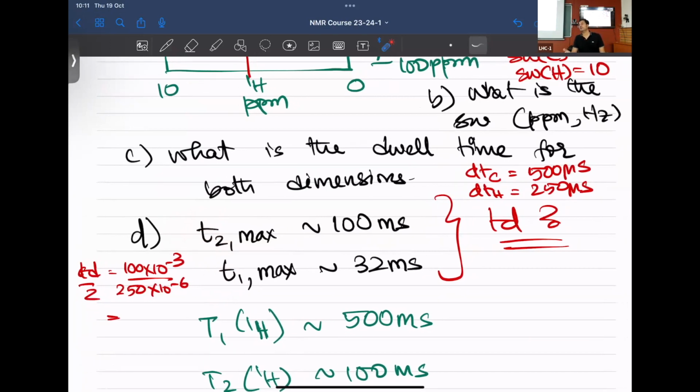If this is the case, you might have set the acquisition time to 300 milliseconds. Is that right, Gaurav? Okay, let's take that as the example. If you had it as 300 milliseconds, what is the total number of real points, Gaurav? I got 2.4K points. 2,400. You see, the number of points you should be careful about. You can't say 2.4 thousand. It should be divided by 10. No, you don't have to divide it.